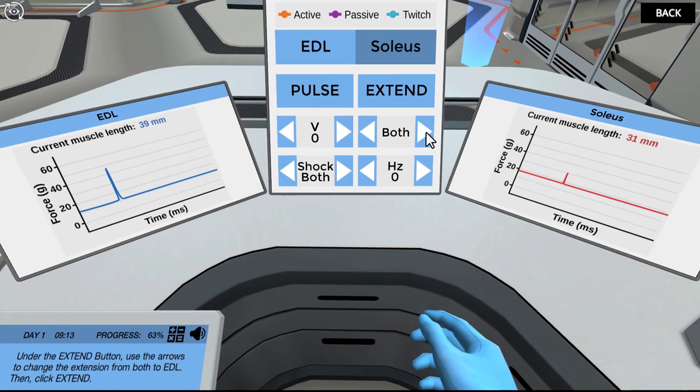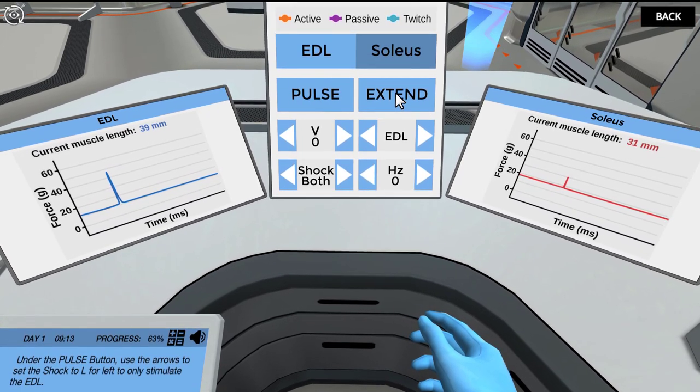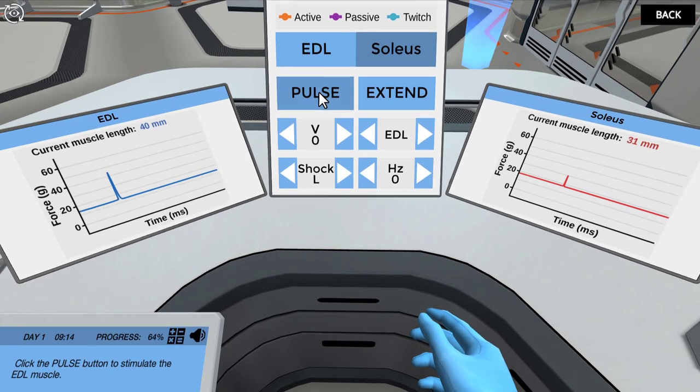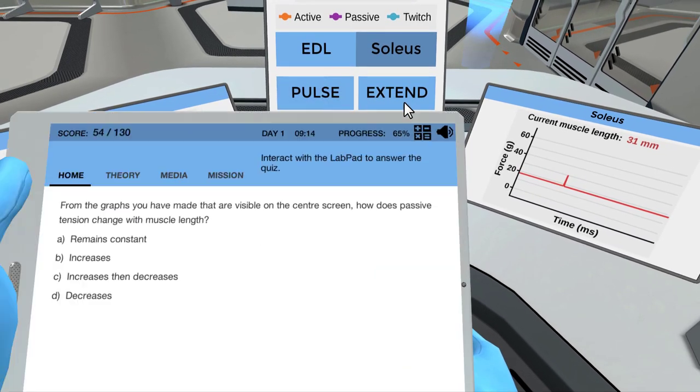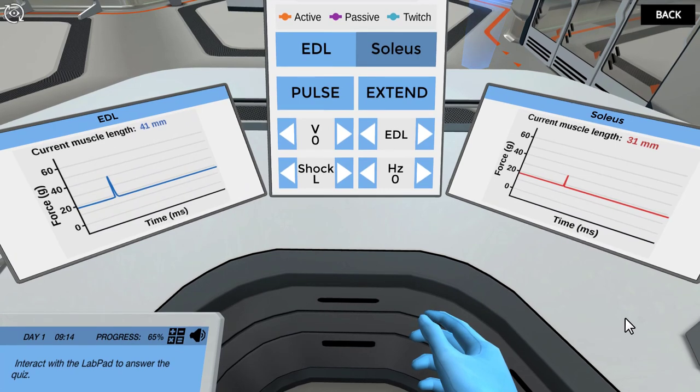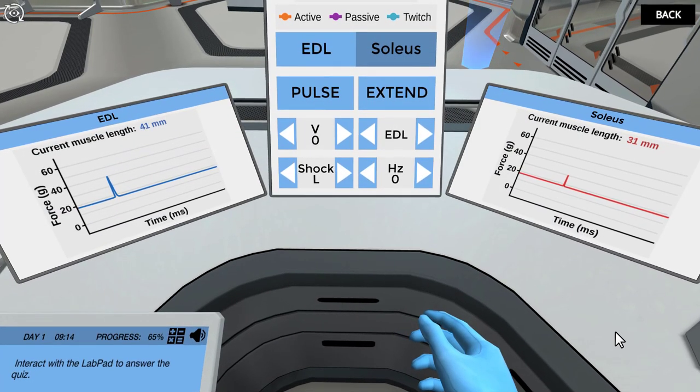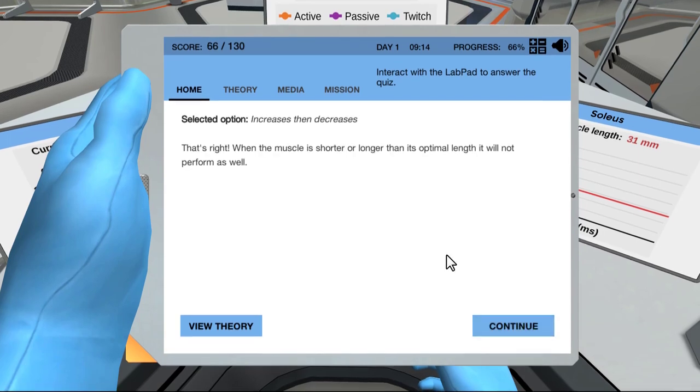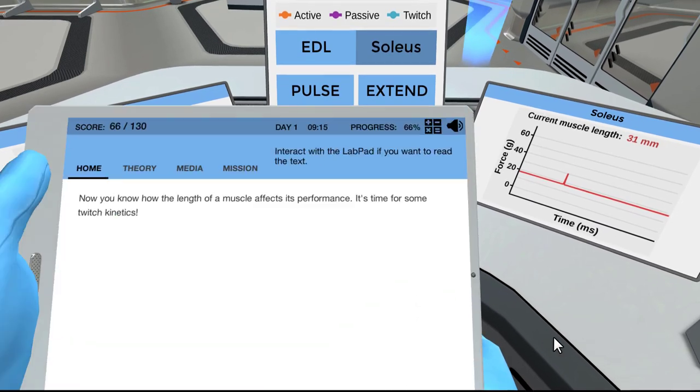Under the extend button, use the arrows to change the extension from both to EDL. Then, click extend. Under the pulse button, use the arrows to set the shock to L for left to only stimulate the EDL. Click the pulse button to stimulate the EDL muscle. Click on the extend button to extend the EDL by 1 mm. Click the pulse button to shock the EDL. From the graphs you have made that are visible on the center screen, how does passive tension change with muscle length? That's right, as you just saw the passive tension of the muscle increases when the muscle is extended, just like a rubber band. How does active twitch tension change with muscle length? That's right, when the muscle is shorter or longer than its optimal length it will not perform as well.